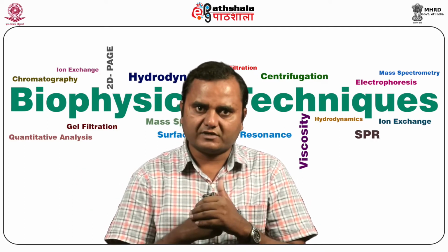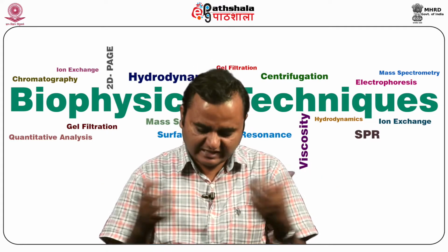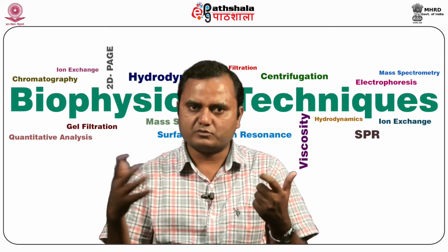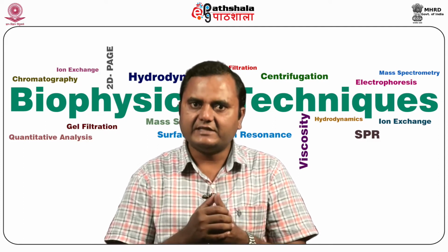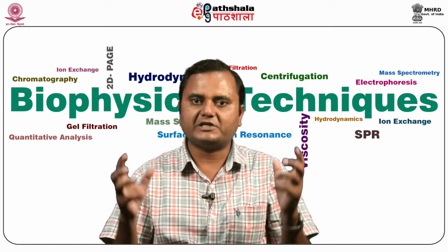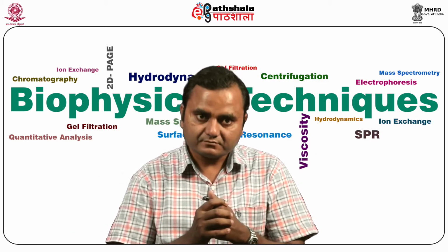It is also used for the analysis of associating systems. For example, if you have two proteins, or one protein forming an oligomer with reference to a change in certain physical conditions, then that can be determined by using ultracentrifugation. It is also used to analyze the stoichiometry, what is the ratio of two molecules, 1:1, 1:2, 2:1, like that.